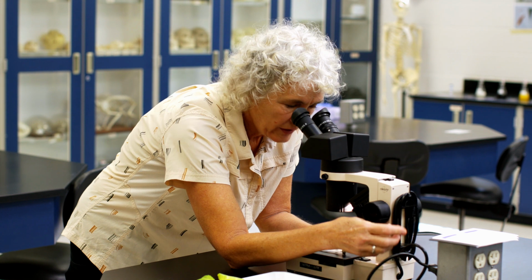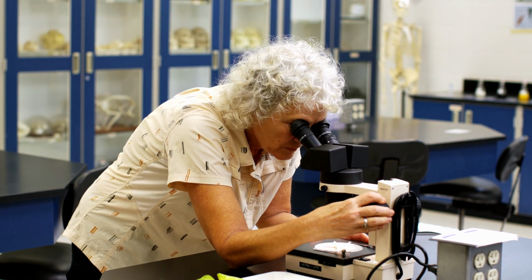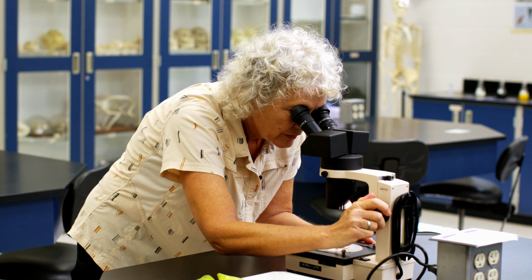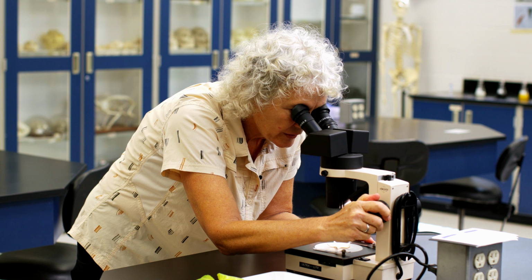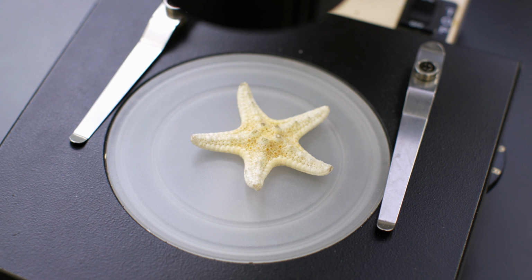So I'm going to just look at it under here and get it in focus. So sometimes, whoops, I think I'm going the wrong way. Here we go. And then when you get it in focus, you can see the surface, in this case, of the starfish, which is pretty cool looking.